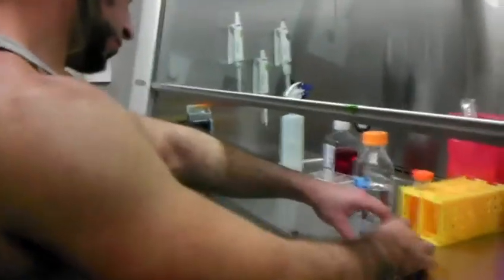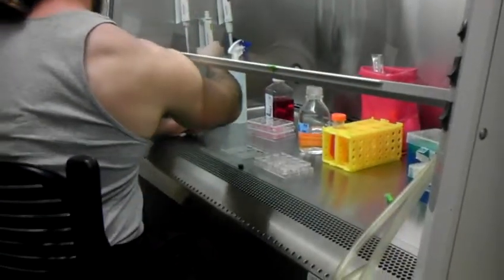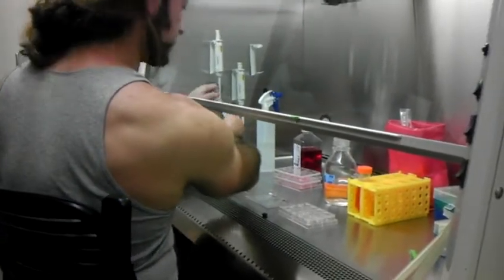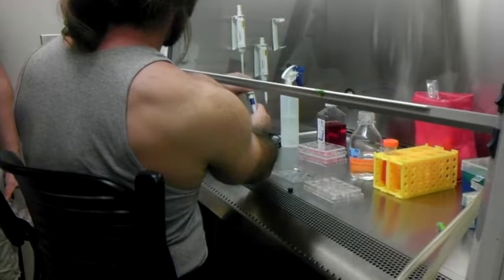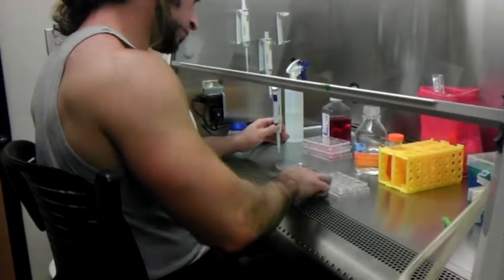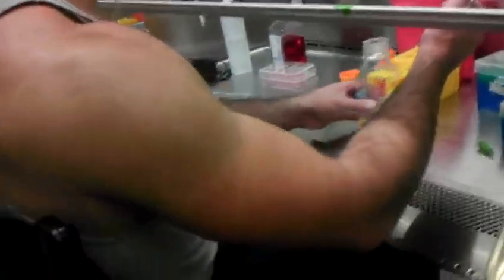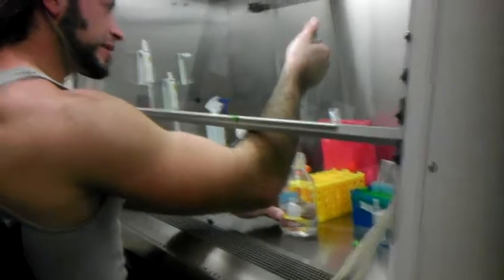That's just going to add basically a mil of PBS to C12. I guess probably just use the micropipette. So just use the big one. Yeah, the big one, 1,000 microliters. Yep. Okay, some of this. Yeah, that's a good one. These big ones. I'm going to do something for the electroporation itself. We'll get to it in a minute though. So each one of these gets 1 milliliter. Yep.